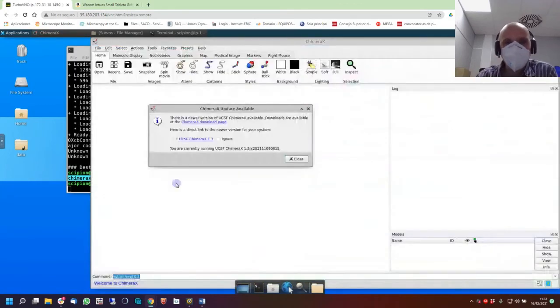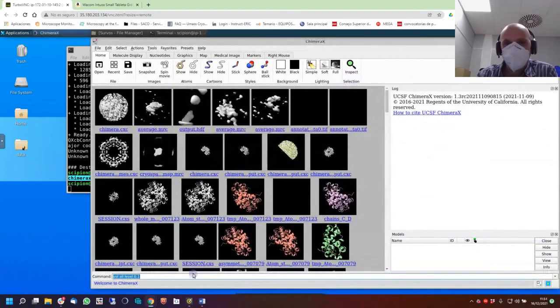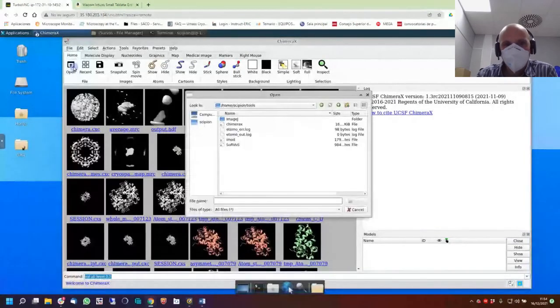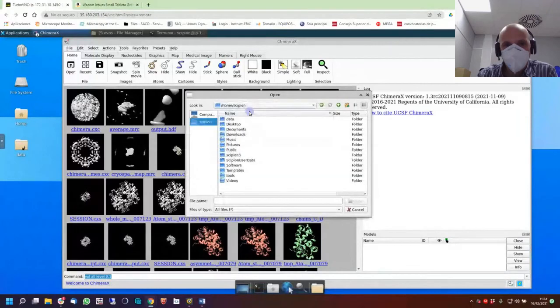These are the old stuff. I don't know if they have the button. Okay, so then open Scipion, this in data. You remember?